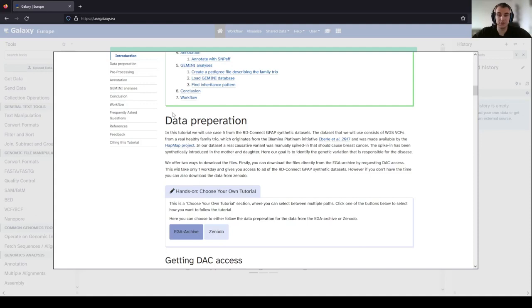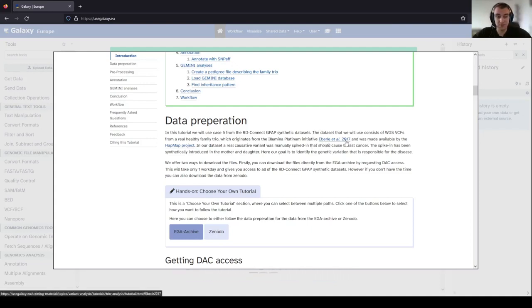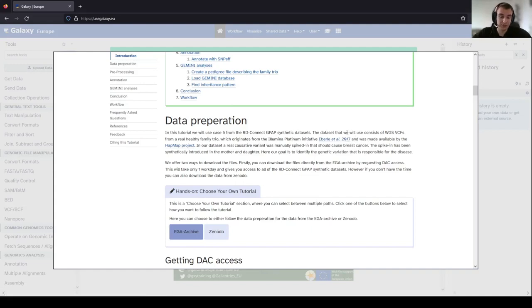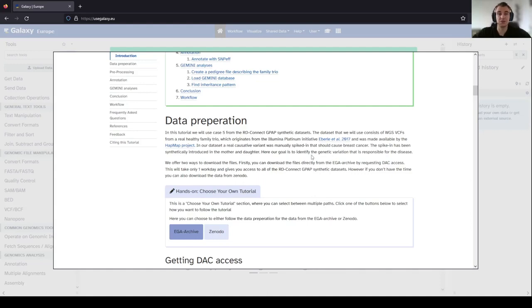First we have to get the data. In this tutorial we are using case 5 from the RD-Connect GPAP synthetic datasets. The datasets have been generated from real family trios which originate from the Illumina Platinum initiative, described in Eberle et al. 2017. This data was also available from the HapMap project. In this dataset, a real causative variant was manually spiked in, which should cause breast cancer. This has been synthetically introduced in the mother and daughter, and our goal is to identify the genetic variation responsible for the disease.